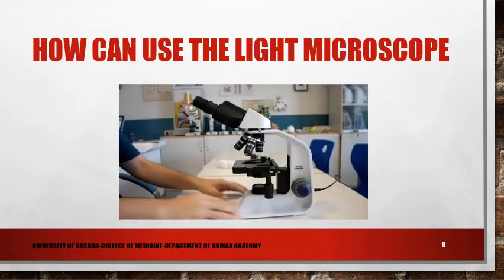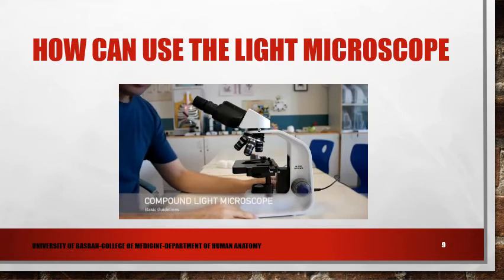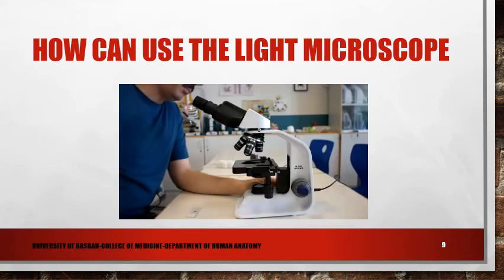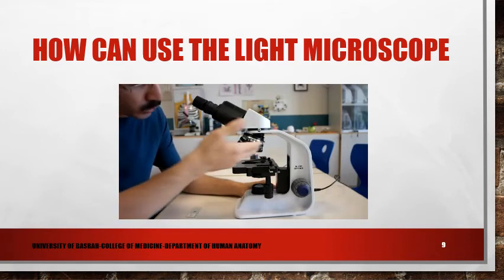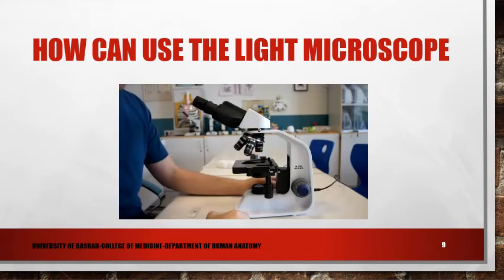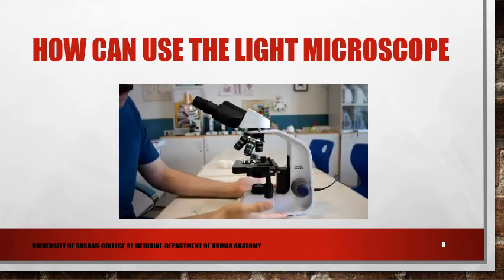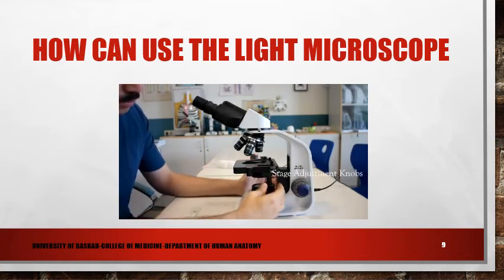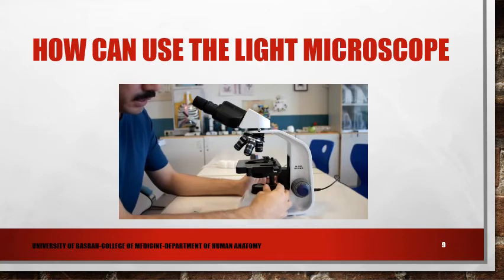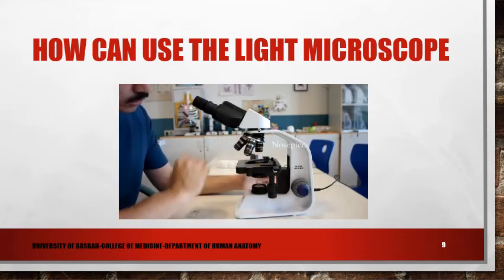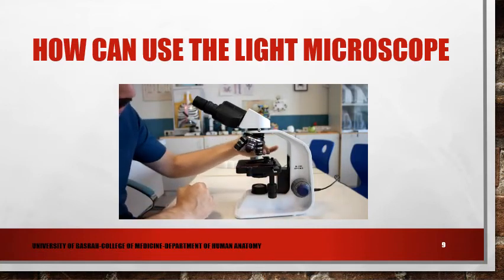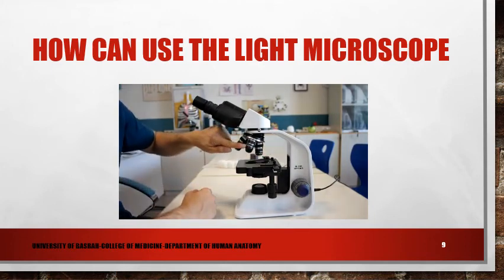This video explains how to use the light microscope. This is a compound light microscope, called compound because light passes through two lenses. This part is the arm, we grab from the arm and support from the base. This is the stage with stage adjustment knobs moving it back, right and left. This is the nose piece holding the objective lenses with different colored lines showing magnification power: 4x, 10x, and 40x.